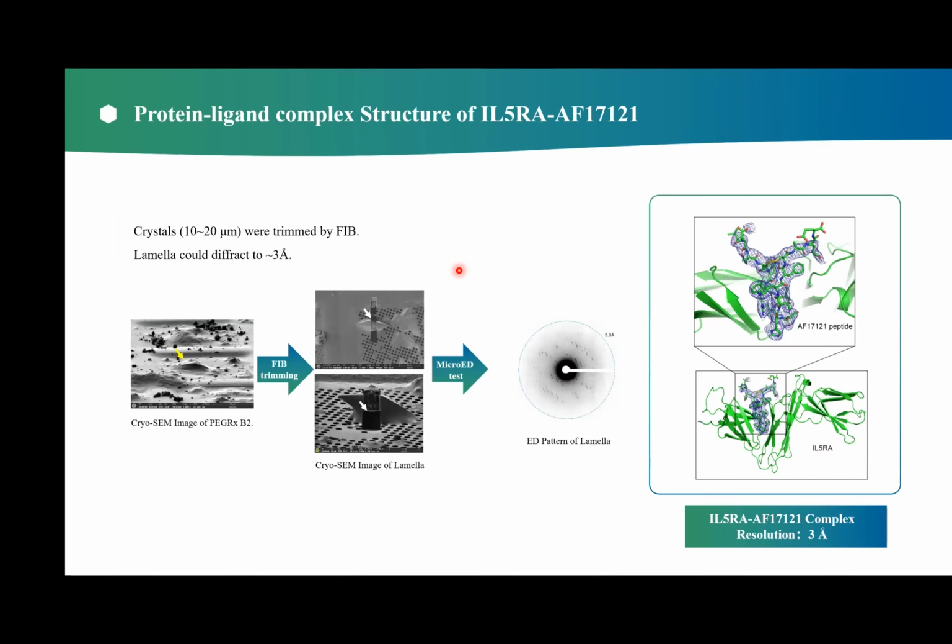Okay. The last example will be about structural biology. IL-5 alpha is an important drug target. Our collaborators first would like to solve the structure of this protein by using traditional X-ray diffraction, but they spent more than half a year trying to grow a large crystal, and failed.